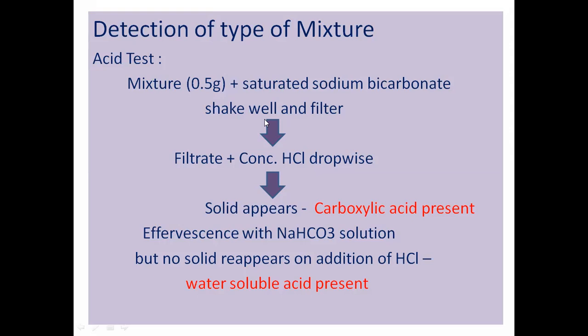Then if it is an acid, when you do the acid test, you do all these steps: saturated bicarbonate, shake well, filter, then add the concentrated HCl to the filtrate. If your water soluble compound is an acid, then here you will not get a solid, only effervescence, with no solid appearing on addition of HCl. Then this is for the acid test.